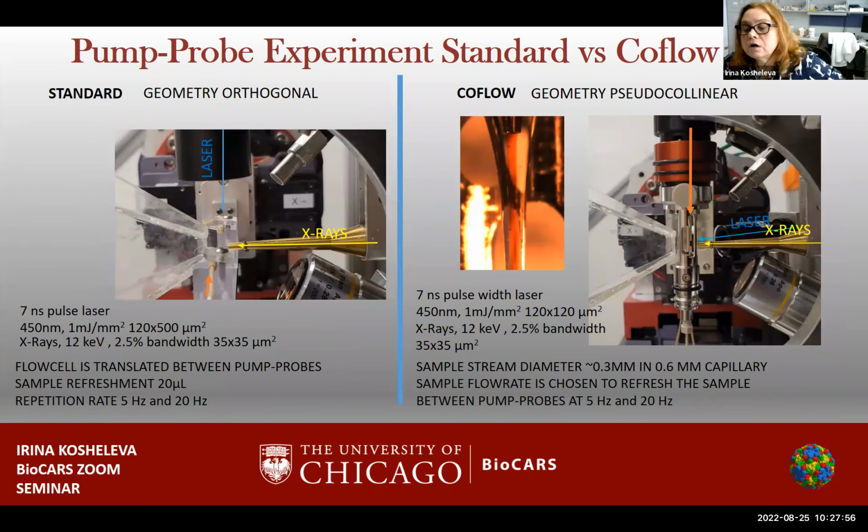We used photoactive yellow protein solution for this experiment to commission the flow cell, and I said that the photoactive yellow protein solution was produced by Seon Kim from Professor Ahe group, KAIST, South Korea.